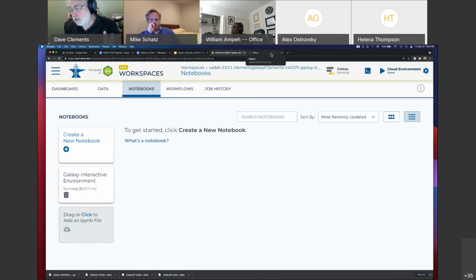Things like interactive visualizations, which we did not touch at all today, you can't do because they're interactive. But you can fire off workflows, you can upload data, you can check the status of your workflows. You can do all that programmatically as well. So if you're a bioinformatician and graphical user interfaces just frustrate you, but you want all the pluses of Galaxy, the fact that it tracks everything, the fact that it keeps track of your parameters that were run, all the reproducibility features, all the authentication features, you can use the API. And that's what we recommend if you're a bioinformatician.